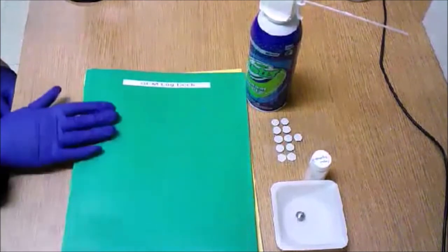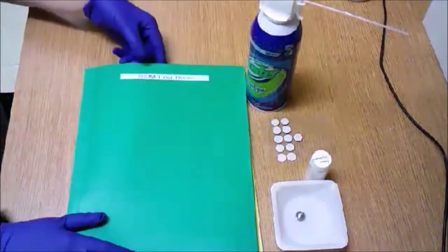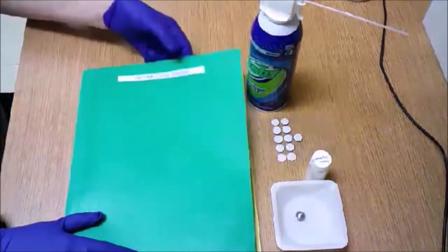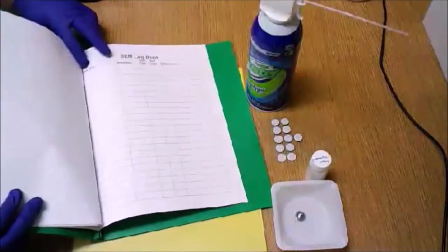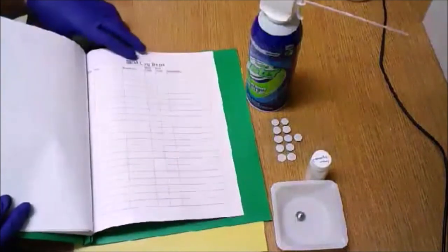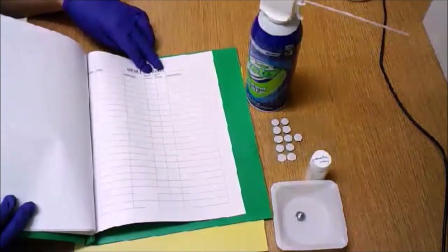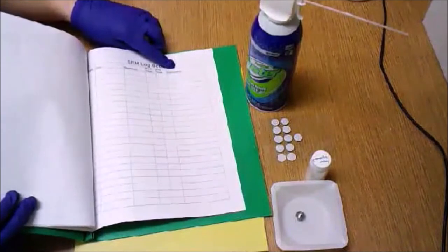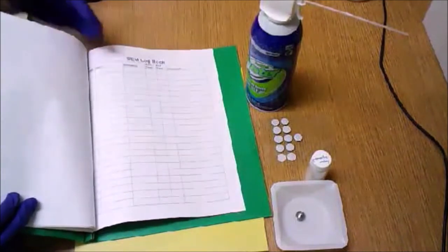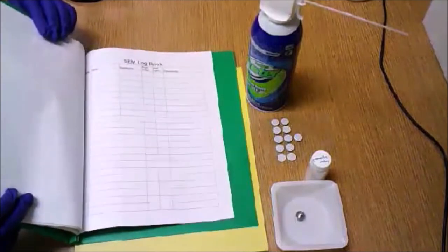First, the SEM logbook should always be next to the instrument and must be filled out before using the SEM. You'll notice that in the logbook you simply have to fill in the date, your name, what your sample is, when you began and stopped using the instrument, and any comments about the quality of its operation. This helps us maintain the instrument and make sure there are no problems.